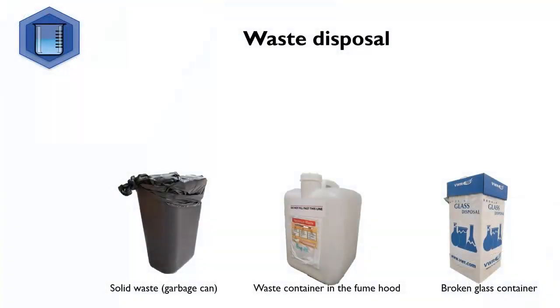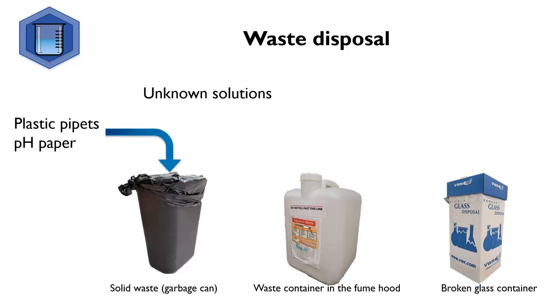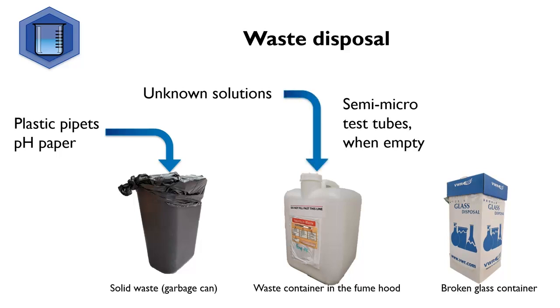Waste disposal. For lab this week, your solid waste, like empty plastic pipettes and pH paper, can go into the garbage can. Any reacted liquid reagents and excess unknown solutions must be poured in the waste container in the fume hood. The semi-micro test tubes that you used and emptied must be placed in the broken glass container.